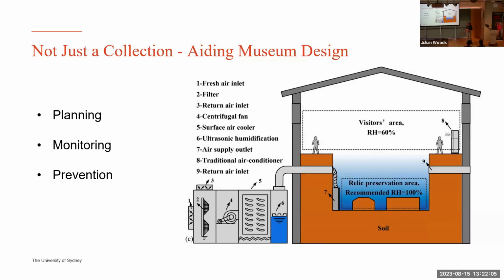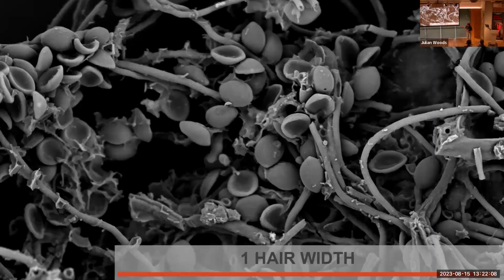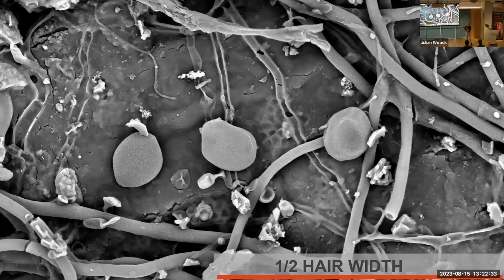Yeah. So also, if we look even deeper into the mold, and you can see everyone's got their reference hairs. We're at a very small scale here. There's these deflated footballs. Let's stay on theme for the current time, soccer balls, if you will. And that's really interesting because I also found these on another sample that didn't have this visible mold on it. So could anyone maybe tell me what these pea-looking things are?